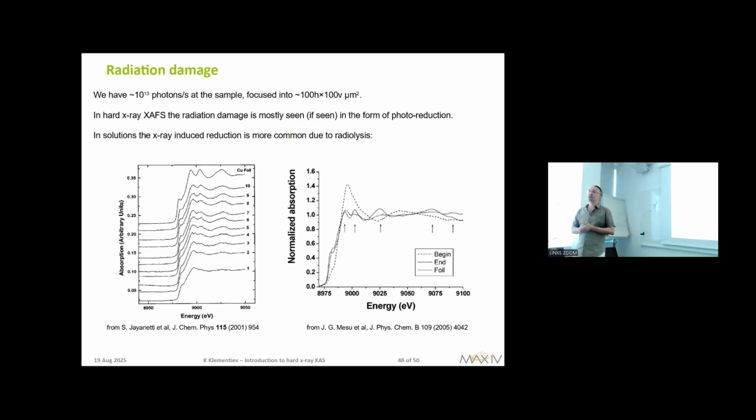minutes about radiation damage. This is an important topic, especially for us. We are a very powerful beamline. There's a lot of flux in the beam. And so sometimes we destroy the sample. And especially sensitive are samples containing water. This is the worst case.